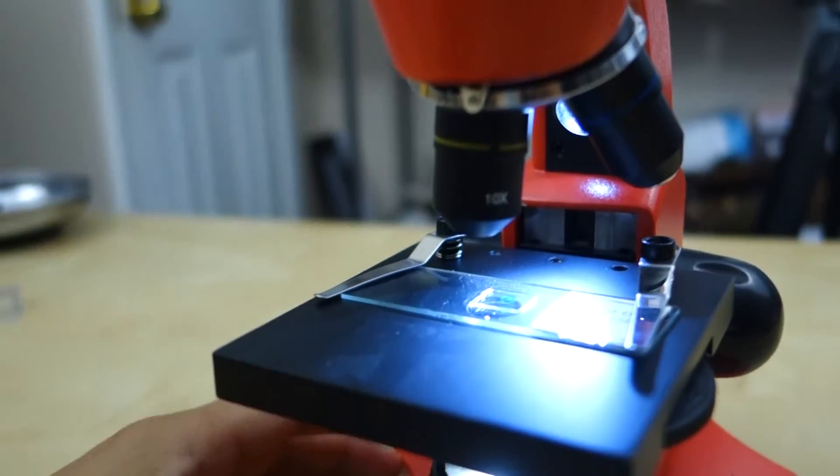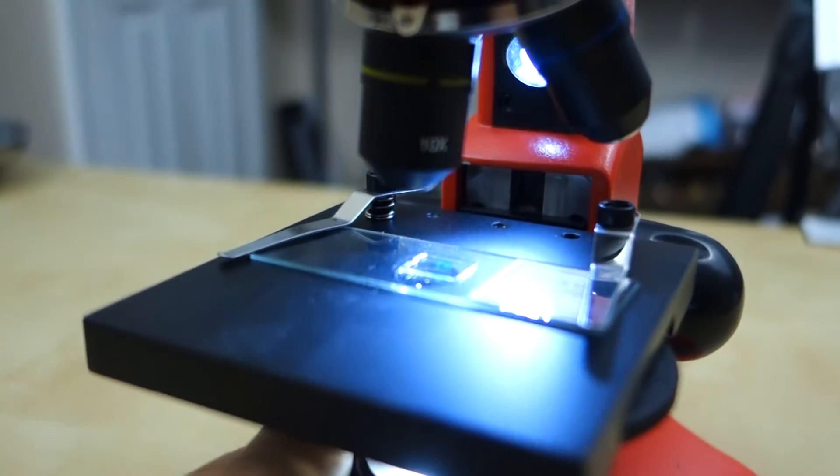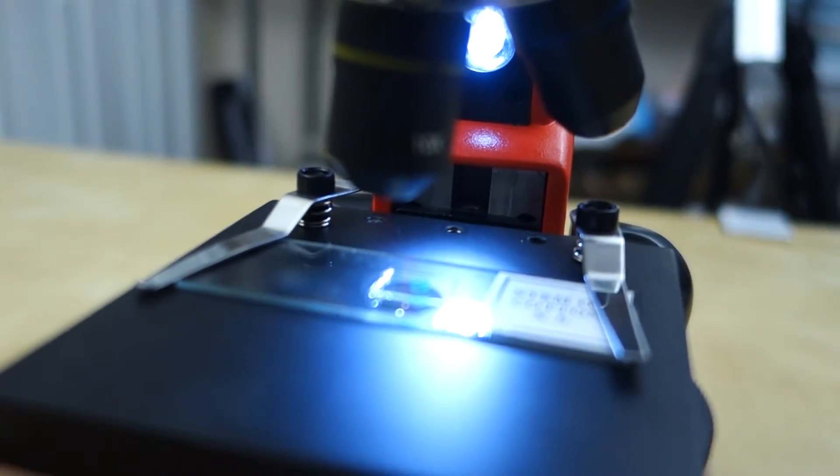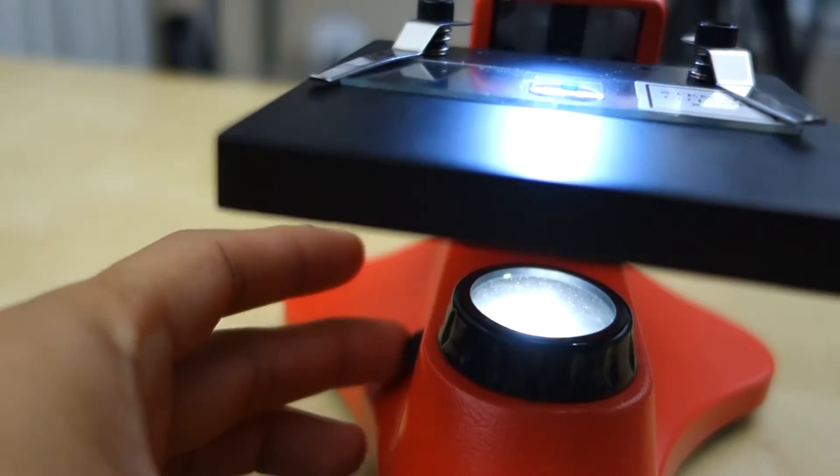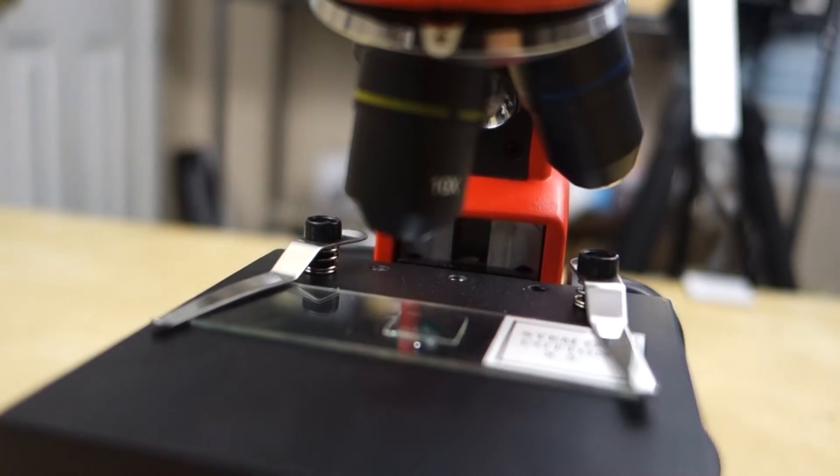And then we have two lights. One is to shine upon this little slide. And that light is right there. And I can adjust that light using this little knob on the left side here. So I can turn it up and all the way down and even off if I want to.